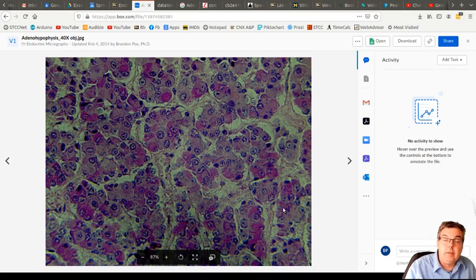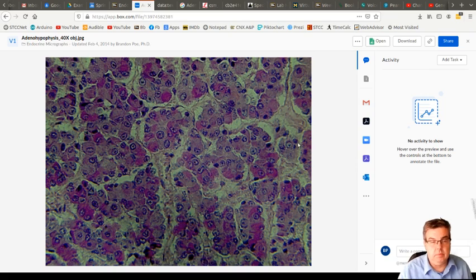Now, there are not that many hormones from the anterior pituitary, so in this region, we're probably looking at a few clusters that make growth hormone or one type of signal. But they are clustered together. And the cells all get a signal from the hypothalamus saying release your hormone or stop releasing your hormone.